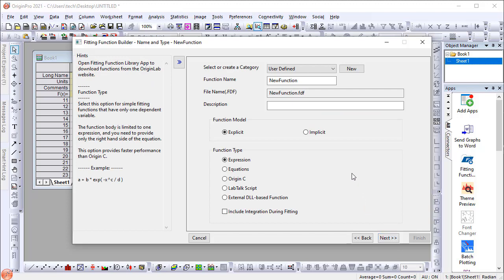set the category to User Defined. Set the function name to Mass Diffusion. Then select Expression for function type.